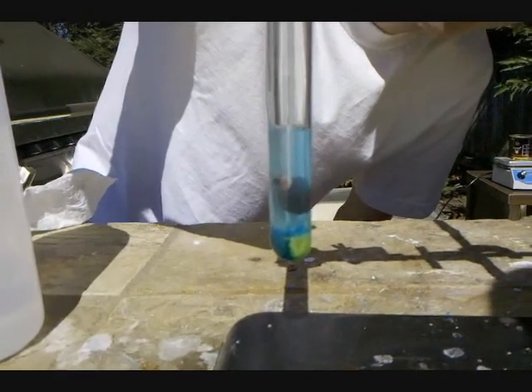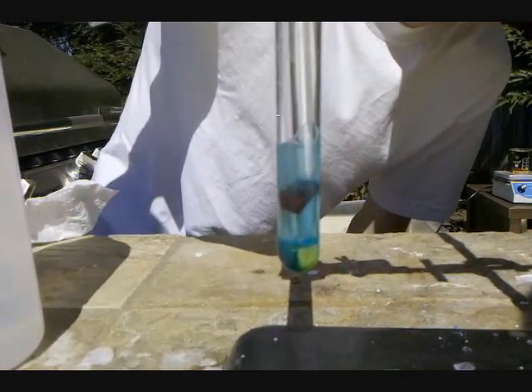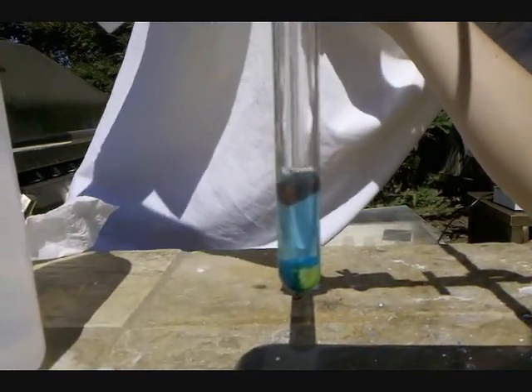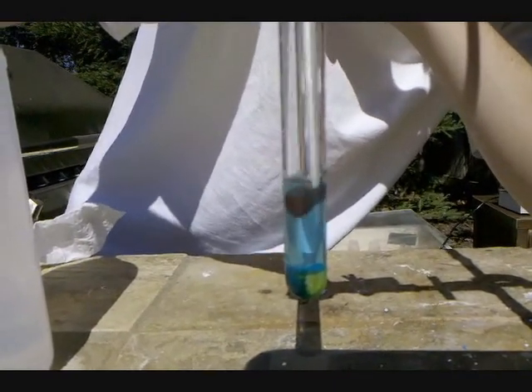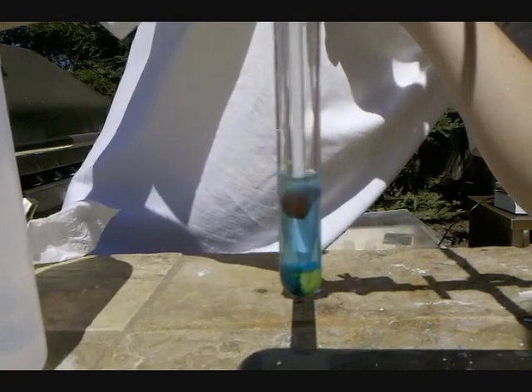I've tried this reaction with bromide and iodide salts. With the bromide salts, a very dark precipitate formed of presumably copper bromide, but the reaction still happened, just a lot slower. With iodide, a very dense precipitate formed of presumably copper iodide, and no reaction occurred.